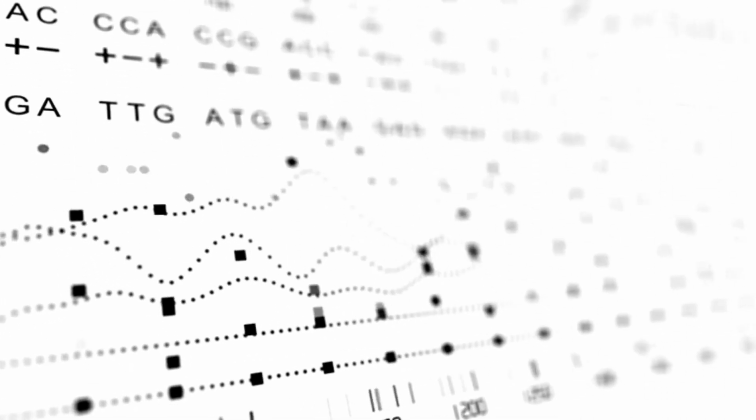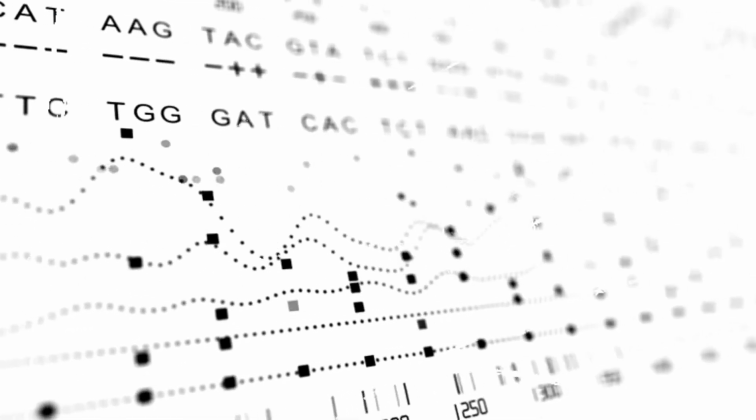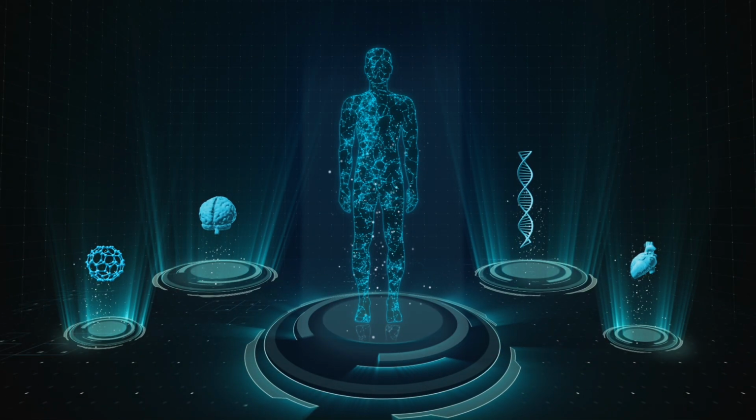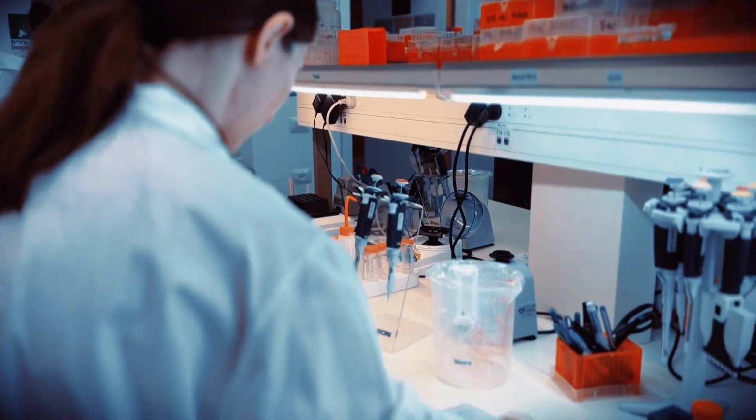But not all reads match easily. Some don't fit anywhere, or they look suspiciously modern. That's when scientists need to ask, is this ancient DNA, or is it contamination? To help answer this, scientists look for damage patterns that are typical of old DNA.